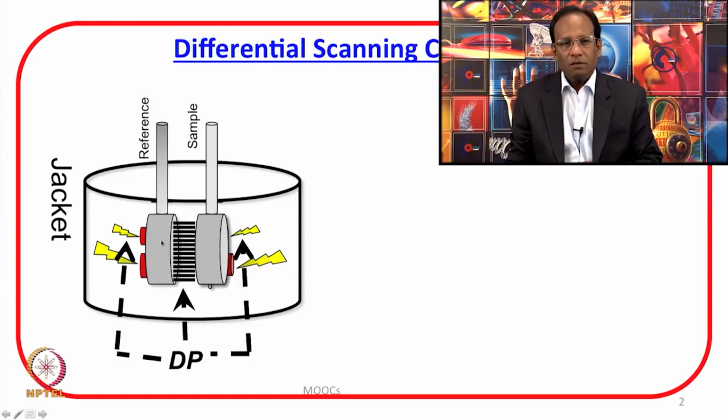Now, since proteins and nucleic acids are usually very expensive, one cannot afford a large amount to be used. Therefore, different companies are making efforts to come up with calorimeters with very small cell volume.